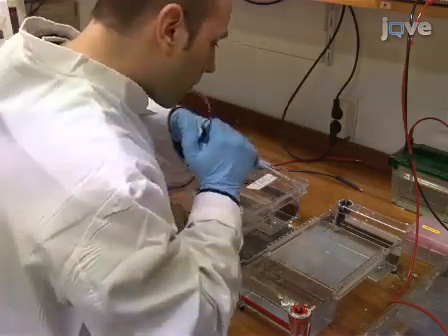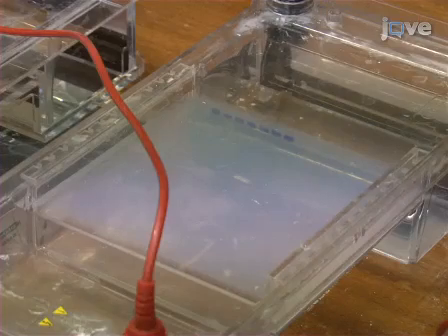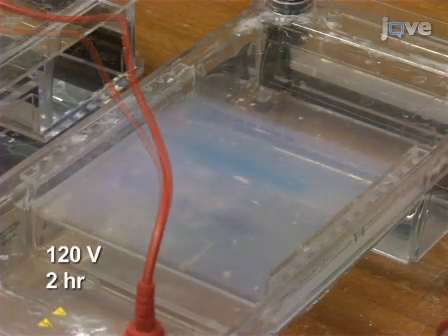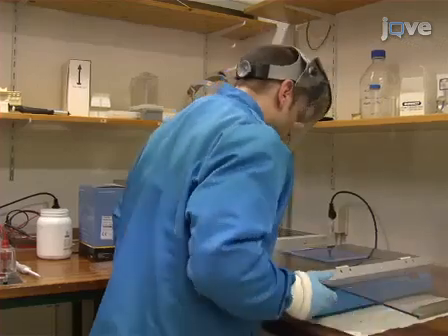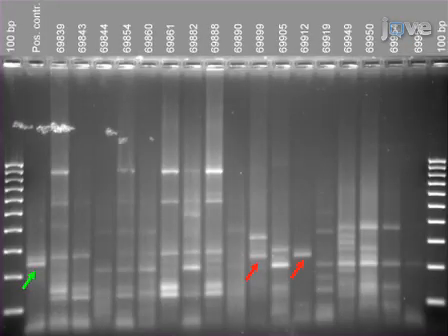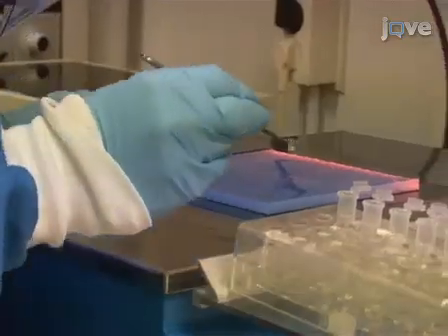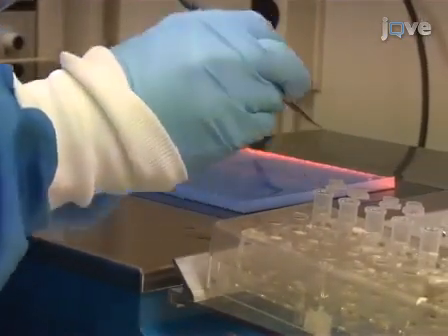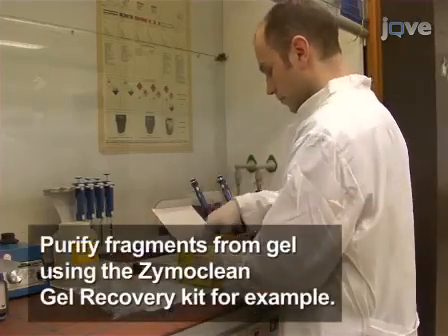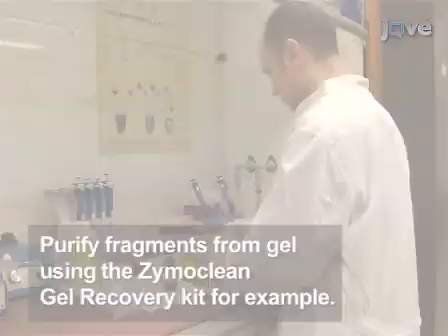Next, load the remainder of the PCR reaction, about 23 microliters, of the candidates on a 2% ethidium bromide stained agarose gel and run for 2 hours. Place the gel on a UV trans illuminator. Then, using a scalpel, excise bands of the correct size and place them into individual 1.5 ml reaction tubes. Using a DNA recovery kit, purify the DNA from the gel fragments for sequencing and identification.